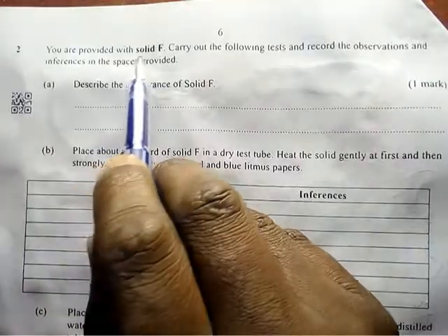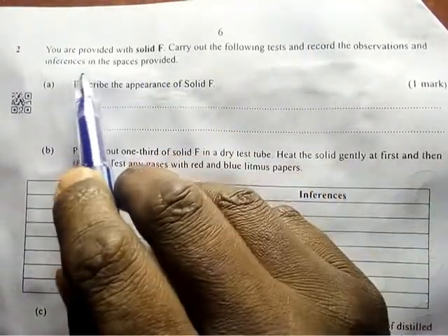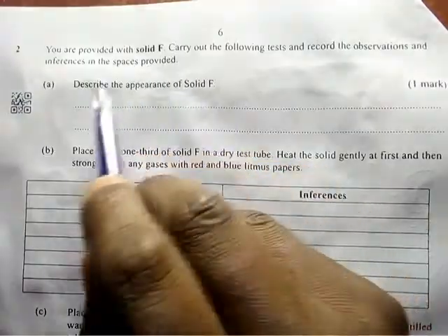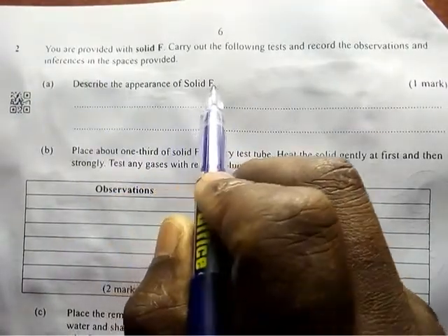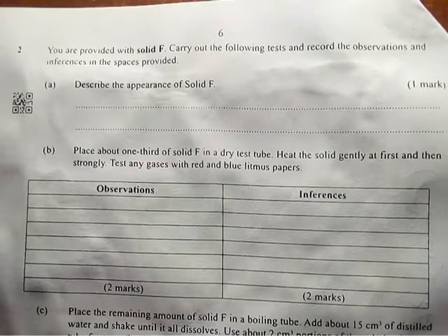You are provided with solid F. Carry out the following tests and record the observations and the inferences in the spaces provided. Describe the appearance of solid F. Solid F was ammonium iron(II) sulfate. Ammonium iron(II) sulfate appears as pale green crystals.